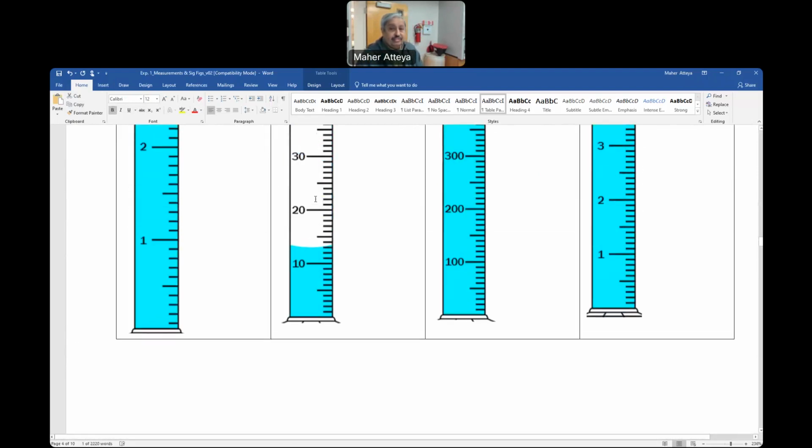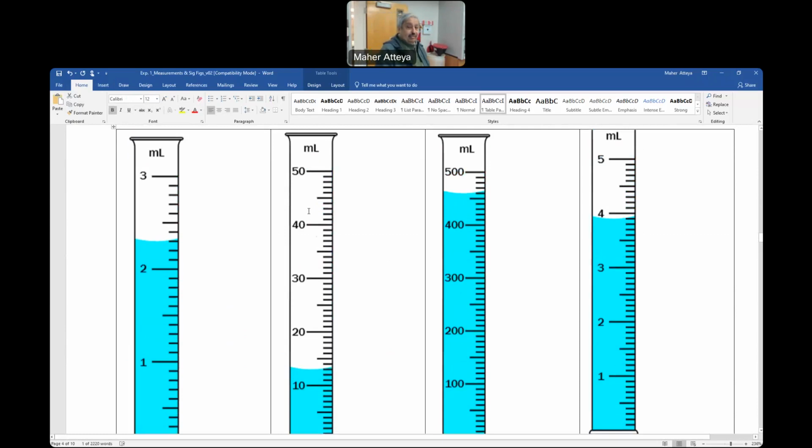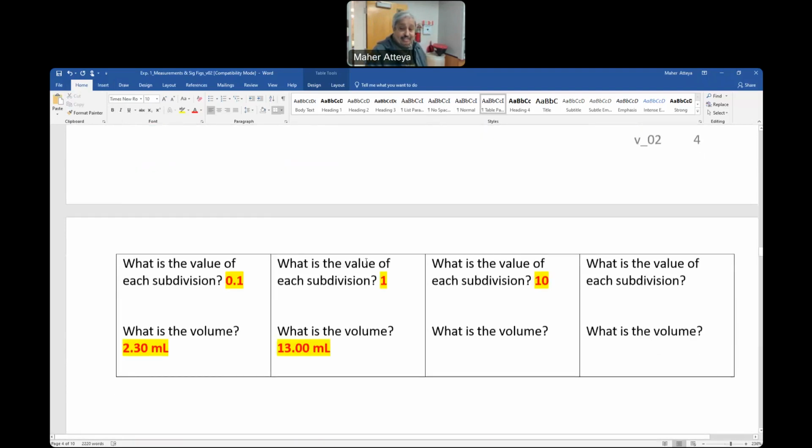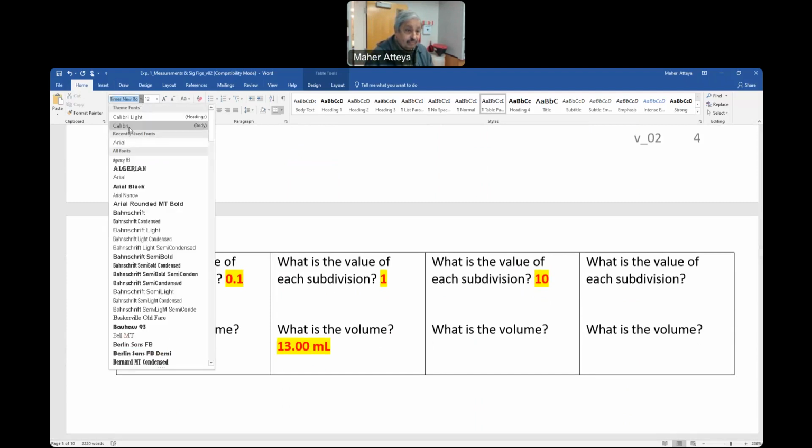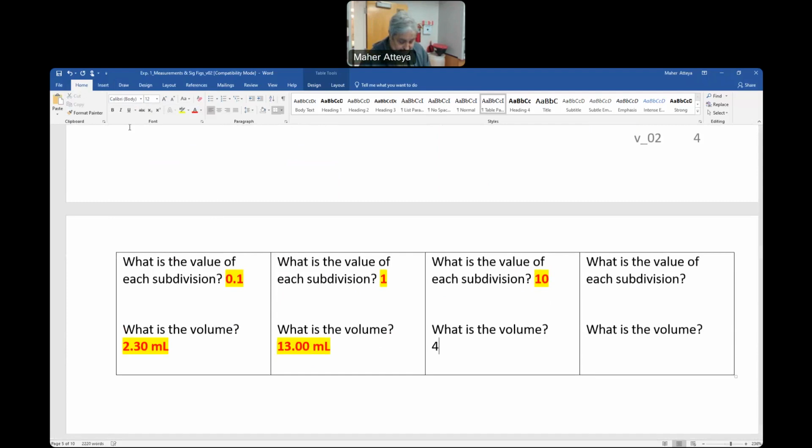Now how much is the value? What's the amount here? So it is 400, correct? And then you have 400, and then this is a 50 in between, correct? So how much is it? 460. Everybody agrees? That's correct. So this is 400, 460 ml. So I come here.